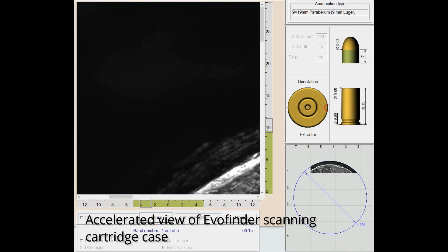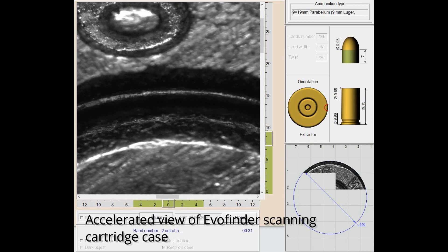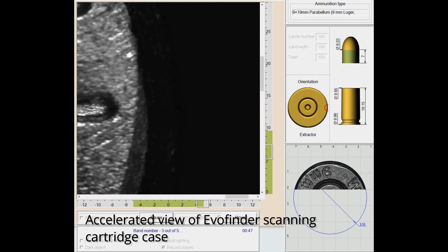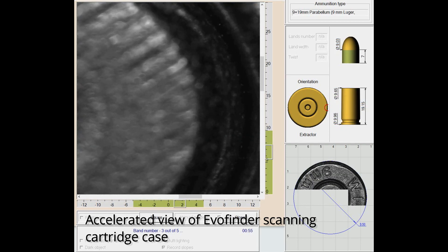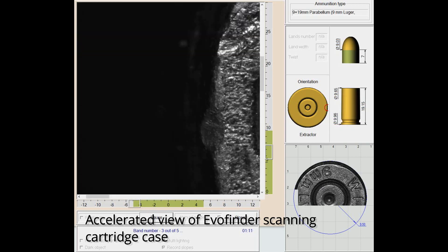This compact screening system can image the bearing surface of a 9mm bullet or entire cartridge case face including firing pin impression in under 3 minutes.